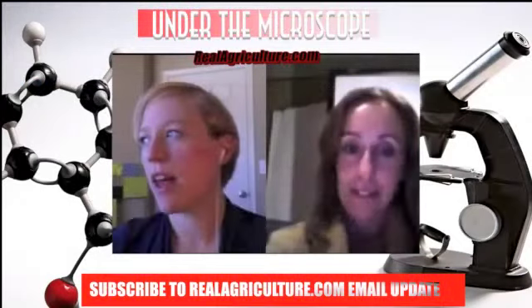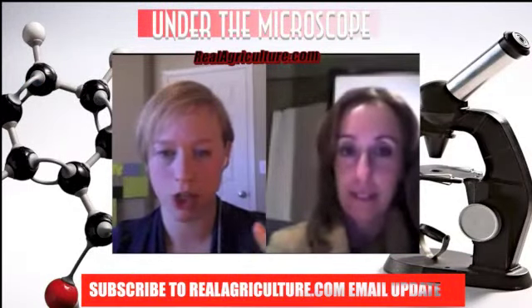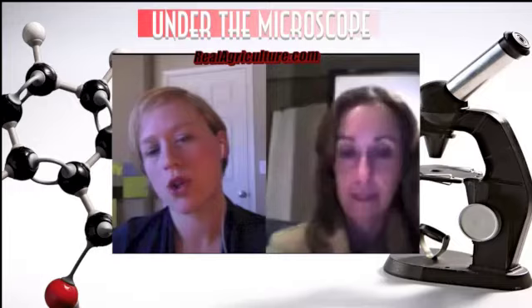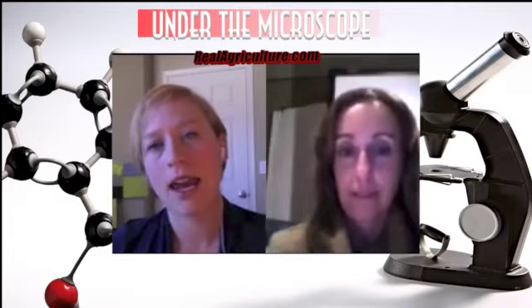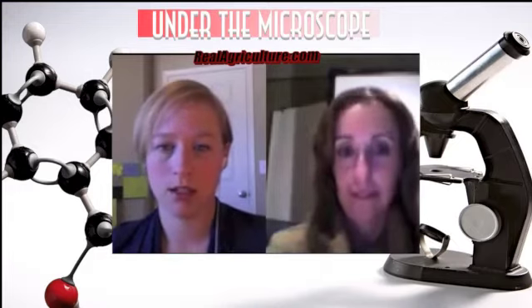Perfect. So now, that of course takes in your germ levels and those sorts of things. But then, of course, we need to account for risk of disease and those sorts of things. So once you've got your germ and your 1,000 kernel weight and you work that out, then next from there, we're going to be looking at vigor, or the cool stress test, and disease screen as well, correct?